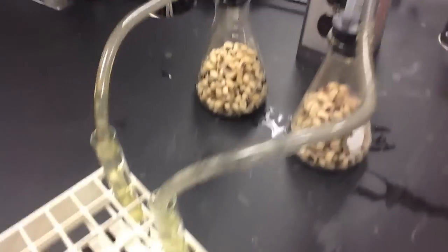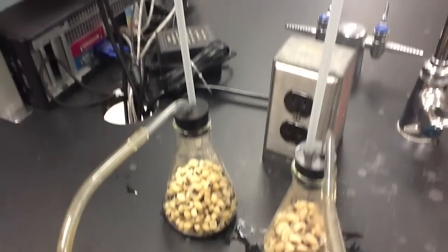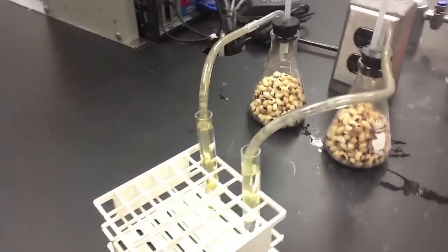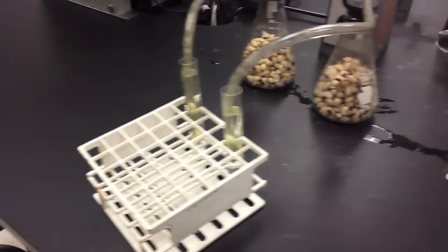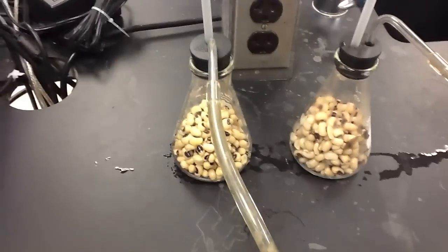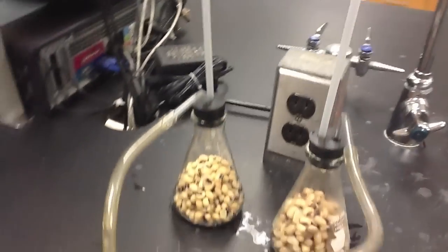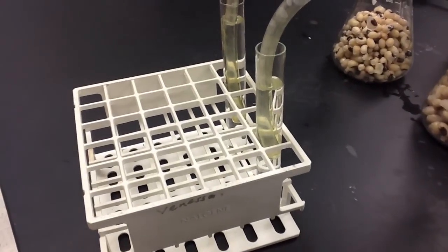The peas are placed into the Erlenmeyer flasks, and thistle tubes along with rubber stoppers are attached to them. Additionally, rubber tubing is run from the apparatus into a test tube filled with water. This creates a sealed environment. In this environment, the peas will utilize any oxygen that's present to perform respiration and ultimately produce carbon dioxide, if they're capable of doing so.